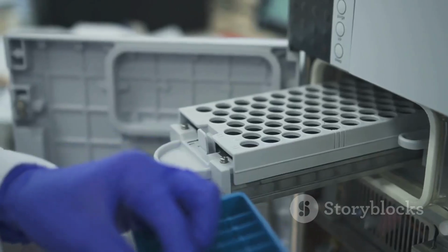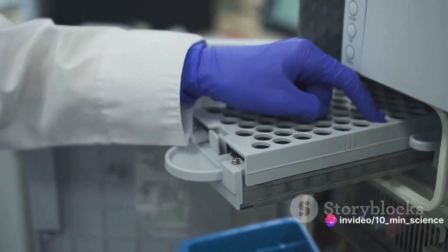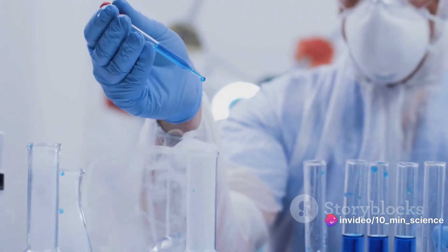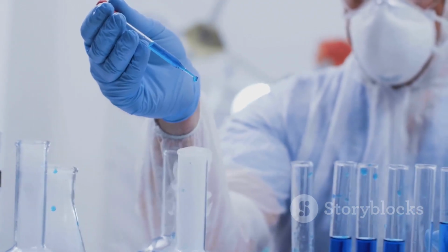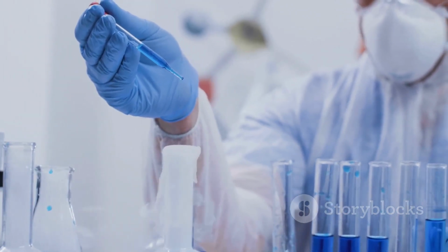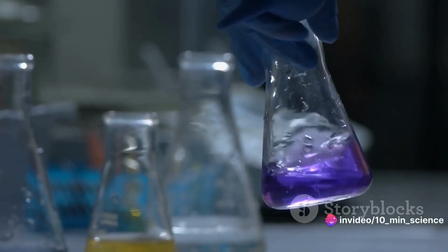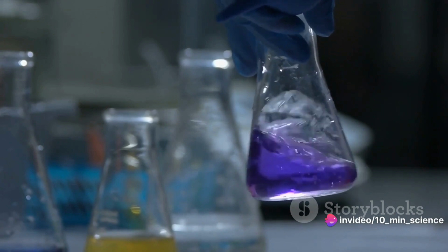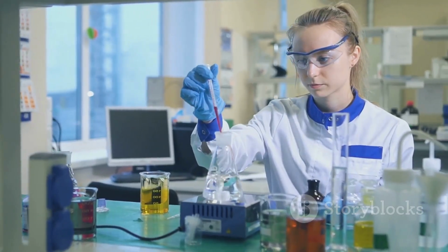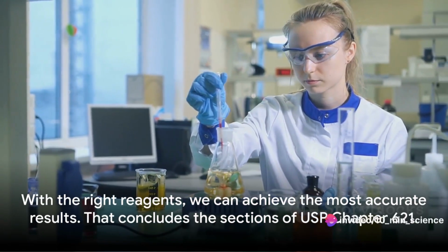Moreover, the reagent can also affect the sensitivity of the detection. Some reagents can enhance the signal of certain compounds, making them easier to detect and quantify. On the other hand, some reagents might interfere with the detection of certain compounds, making them harder to quantify. So, you see, the choice of reagent is not a trivial matter. It requires careful consideration of the properties of the reagents and the compounds in the sample, as well as the goals of the chromatography experiment. With the right reagents, we can achieve the most accurate results.